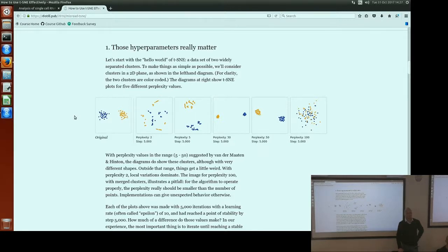If you run t-SNE on 2 samples, 2 experiments, and you want to see the differences between them? So the question is whether it's a good idea to use t-SNE on 2 different experiments to find out the similarities between the experiments. I think this is a bad idea, as Davis just mentioned. On a t-SNE plot, the distances do not correspond to real distances between the cells. So it's better to use a PCA plot for these purposes. And we will discuss that later, actually.